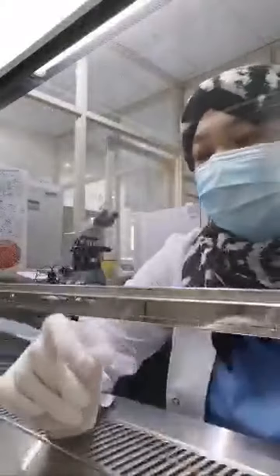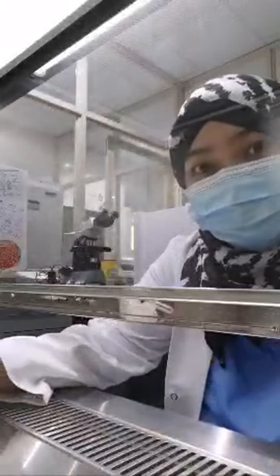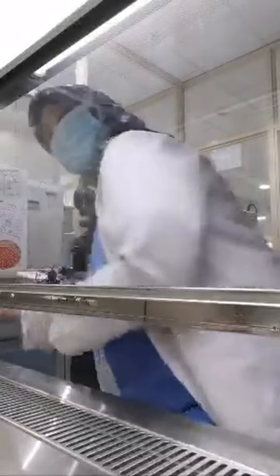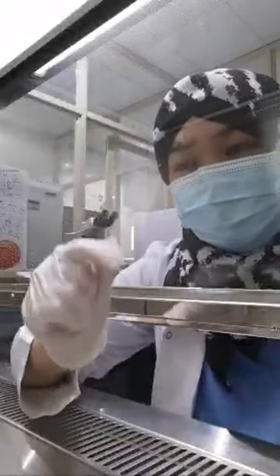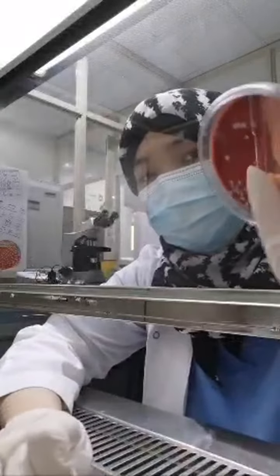One characteristic of Staphylococcus is that it is catalase positive. What we need is hydrogen peroxide, a slide, and the agar or colony.